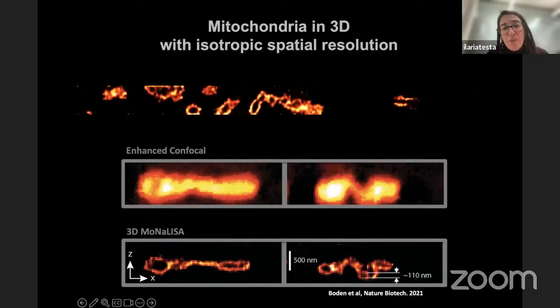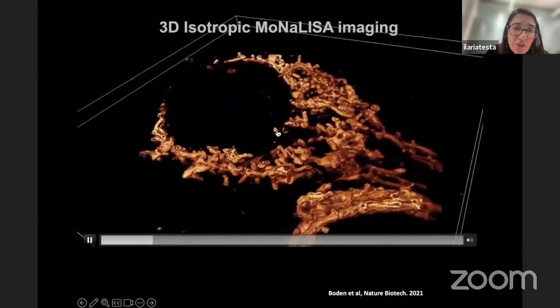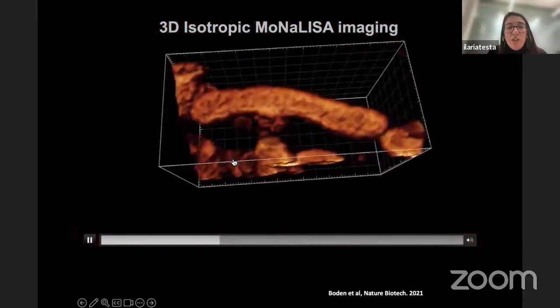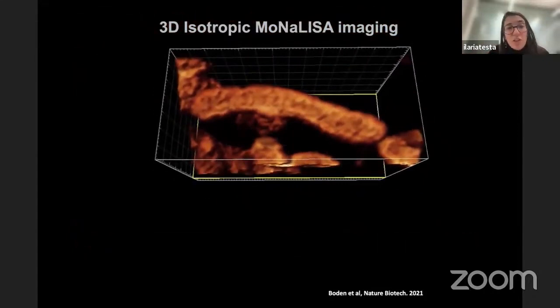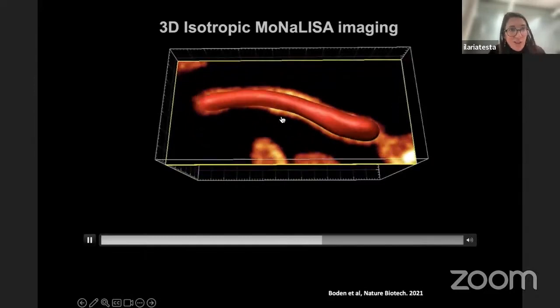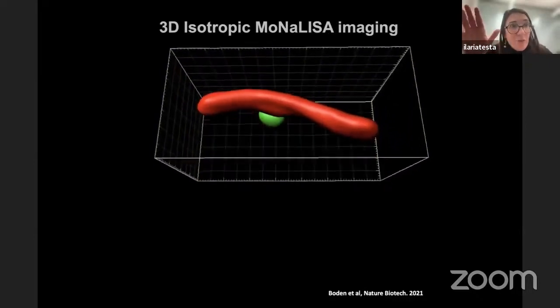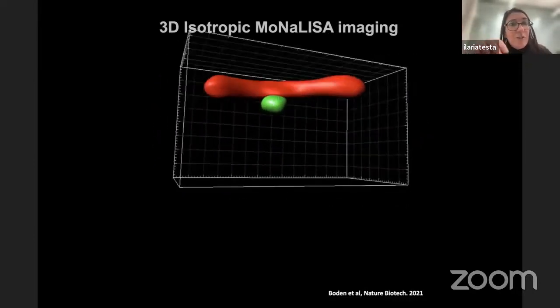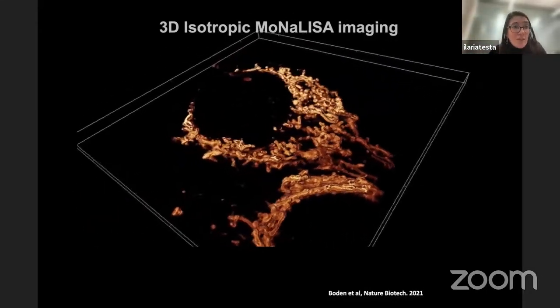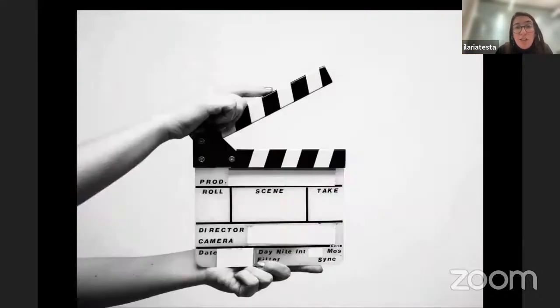So you can pinpoint the outer membrane. And what we are actually excited about is studying their morphology, especially these tiny vesicles that are budding out from them. You can go into very crowded 3D parts, like the perinuclear mitochondria, and start to look at them. Then you realize that some of them are not just tubules, but they protrude this tiny vesicle that can be a symptom of getting rid of protein because the mitochondria is suffering, or the mitochondria wants to give biogenesis to other organelles like peroxisomes. So that's what we are focusing on.